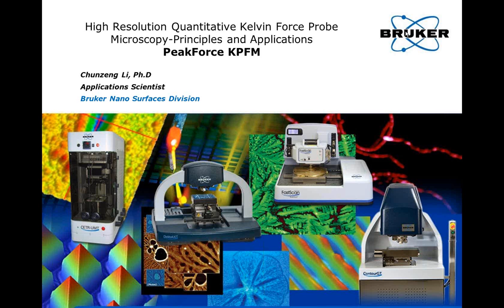Thanks, Thomas, for the introduction. And thanks, everyone. Good morning. So again, this is Chunzeng Li, application scientist at Bruker Nano Surface Division. Today I will talk about high-resolution quantitative Kelvin probe force microscopy. I will talk about the principles and applications. So mainly I'll focus on one new mode that's called PeakForce KPFM.